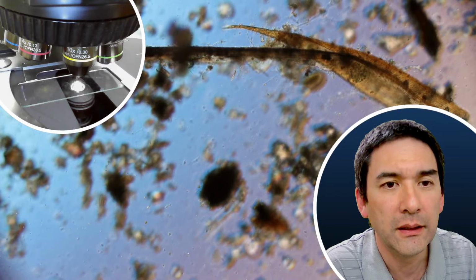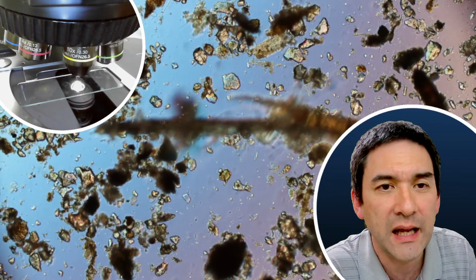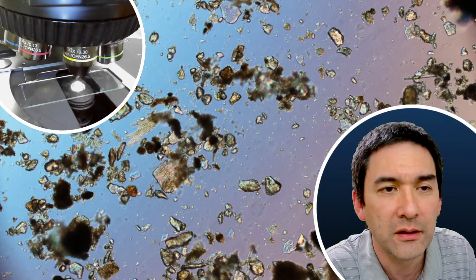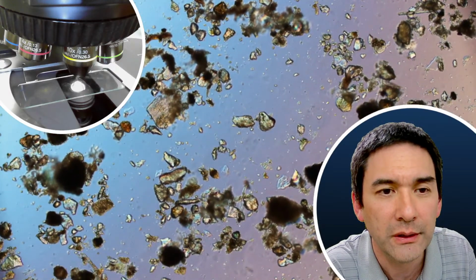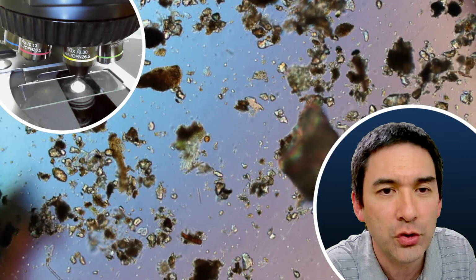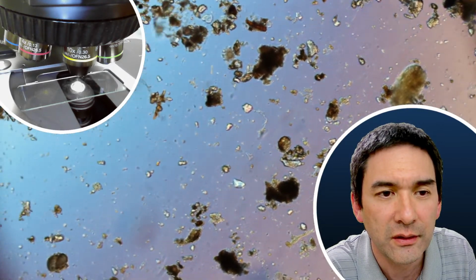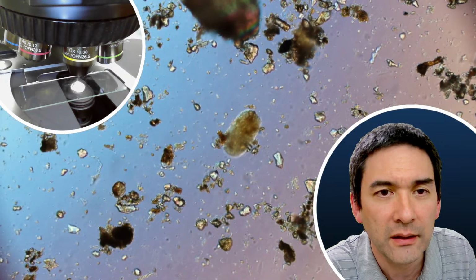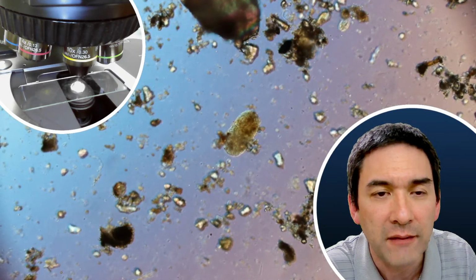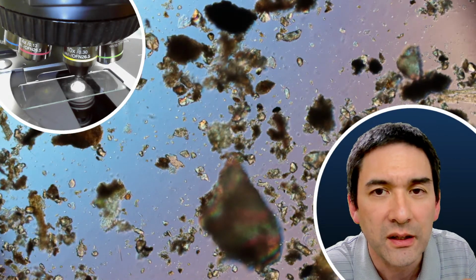Then you have to be really patient, and you have to scan the sample, hoping to find something. You can see that there is already quite a bit of life going on here. But it's a question of patience now to actually find some tardigrades. Often it's not that there are few tardigrades present, but sometimes they simply haven't come off the moss because they have little claws and they don't want to come off so easily.